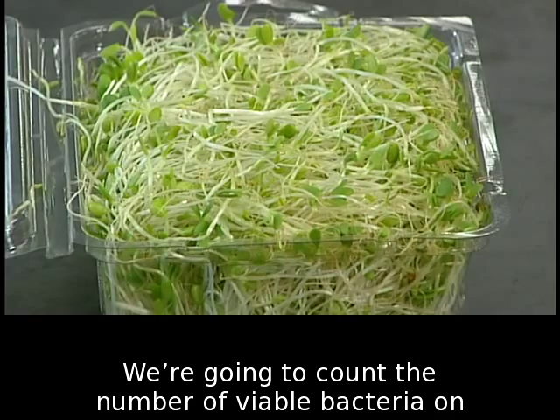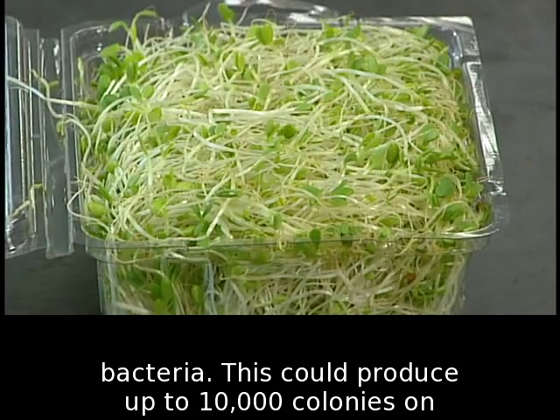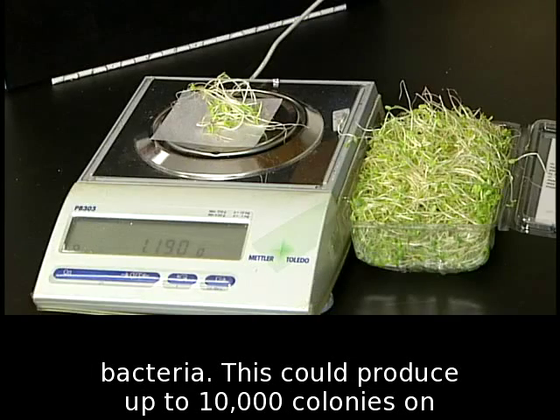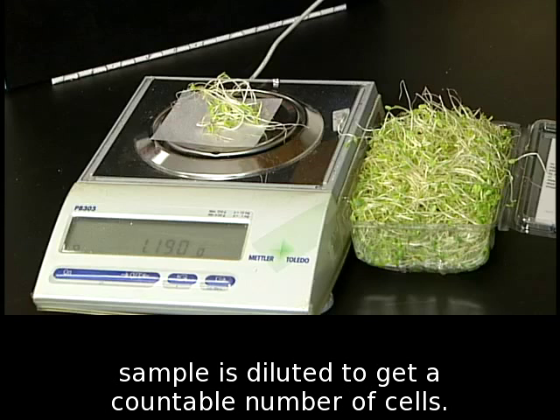We're going to count the number of viable bacteria on alfalfa sprouts. 1 gram of food may have 10,000 bacteria. This could produce up to 10,000 colonies on a plate, clearly too many to count. Therefore, a sample is diluted to get a countable number of cells.